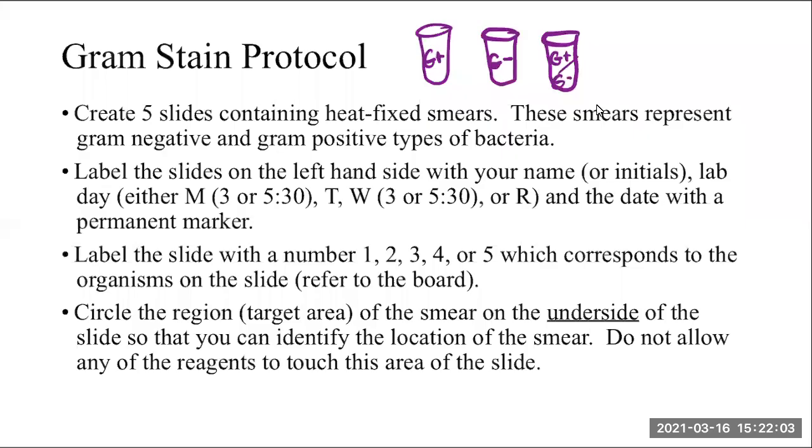This would be a liquid culture, so you wouldn't have to put a drop of water on first. You would just put 1 to 2 loopfuls of bacteria per slide.